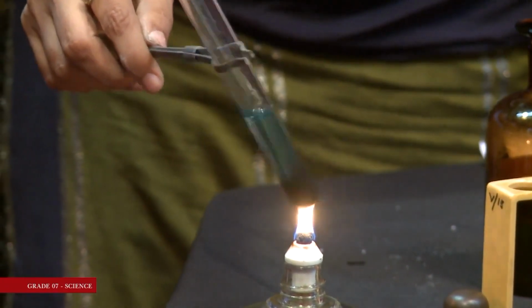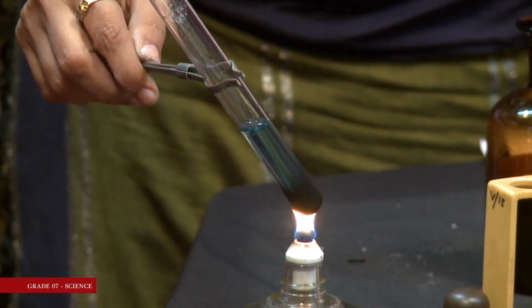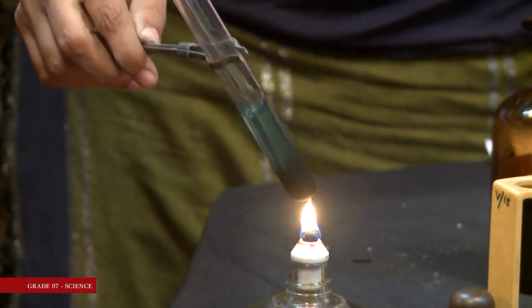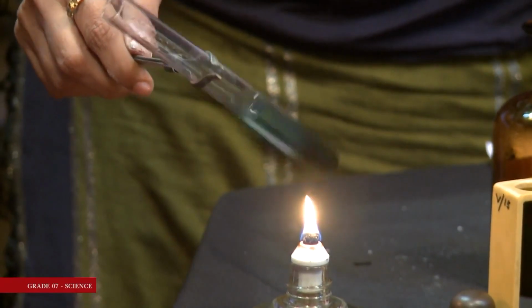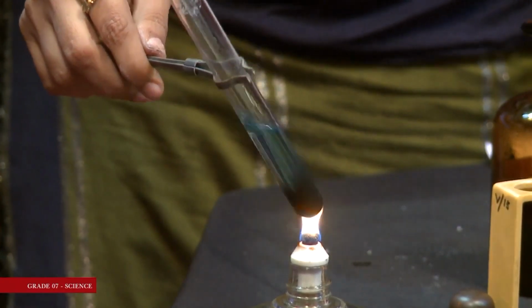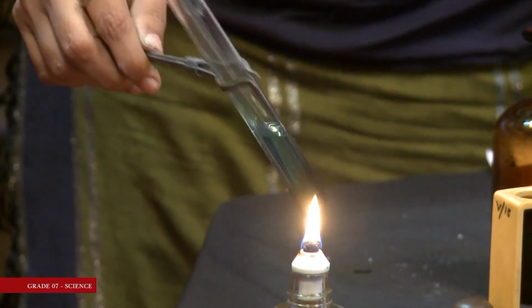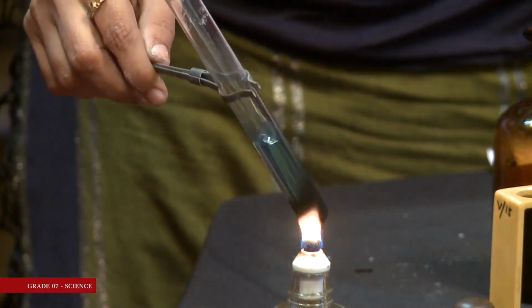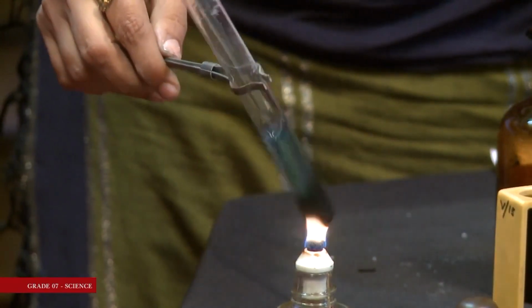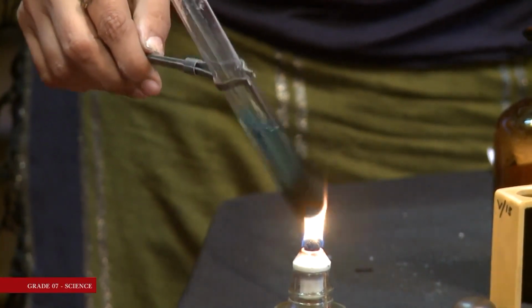You can check whether there is any difference in the color. I continue heating. You see I am shaking the test tube. It will take a little time.